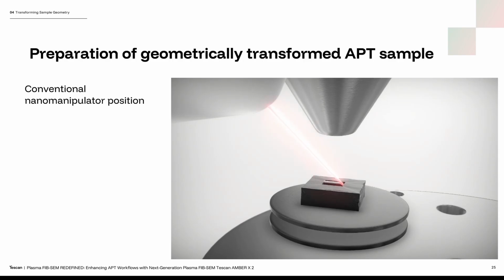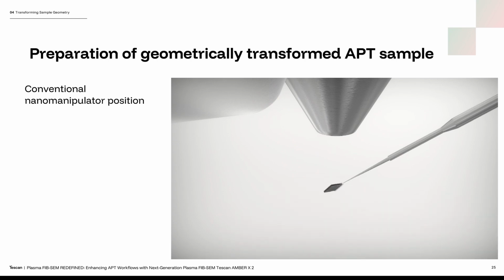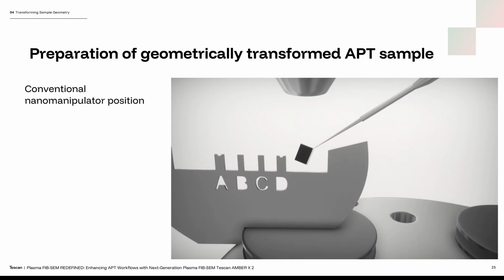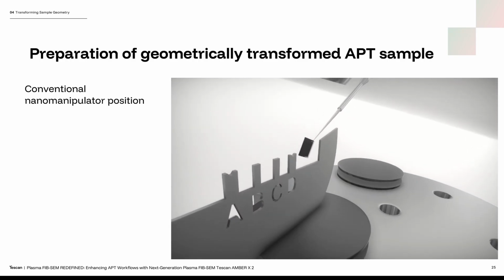An inverted specimen may sound simple, just rotate it 180 degrees, right? But in practice, it's far more challenging, especially with regular rotation manipulators. So let me show in this video why. If you approach the sample from the side as you would with a conventional manipulator and rotate it 180 degrees, the resulting geometry and orientation are completely different from what's needed for a proper inverted specimen. So take a look at this visualization, and you can see the orientation of the specimen after a 180-degree rotation.